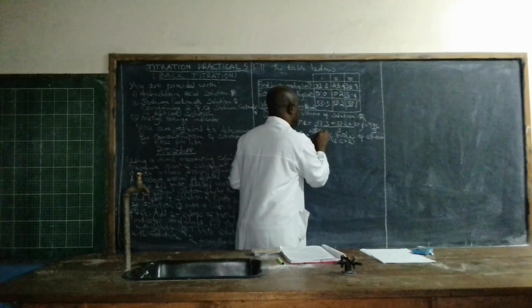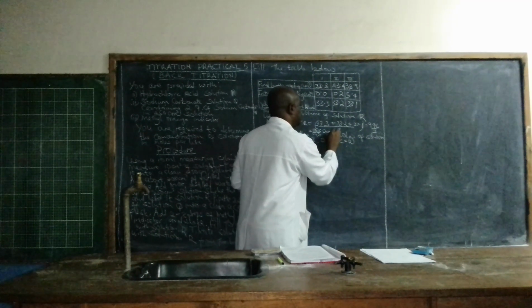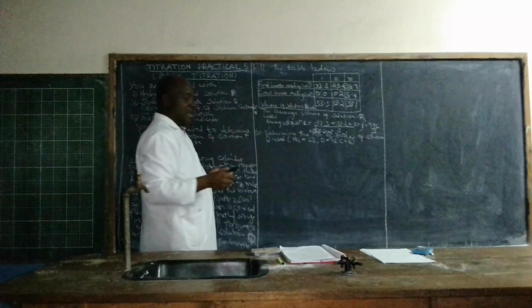So we write here 33.2 cubic centimeters as our average volume.